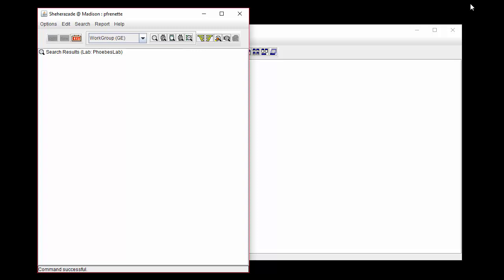Protocol trees may be used to add fields to item records, to record input parameters and outcomes from the protocol steps, and different measurements, etc. Protocol trees may report any kind of data a lab would like to keep track of in addition to the existing fields. This data may later be used in reports or for data mining, etc. Other parts of lab protocols are covered in separate videos.